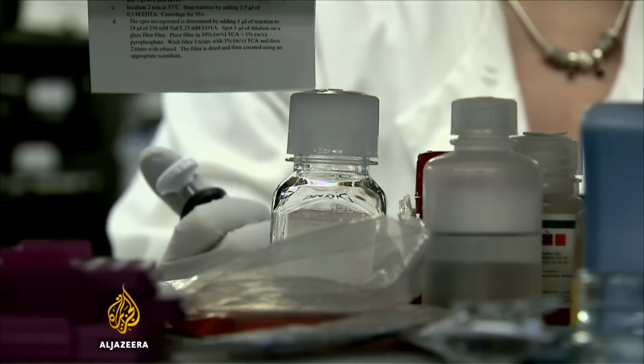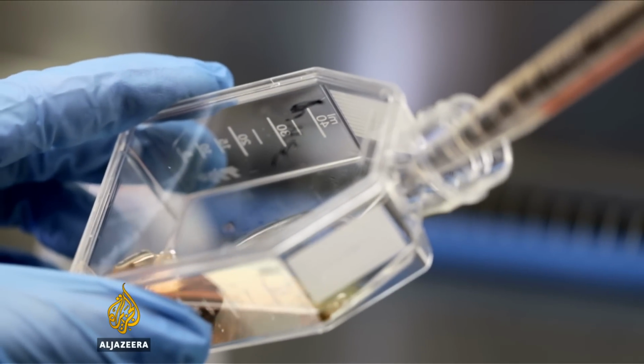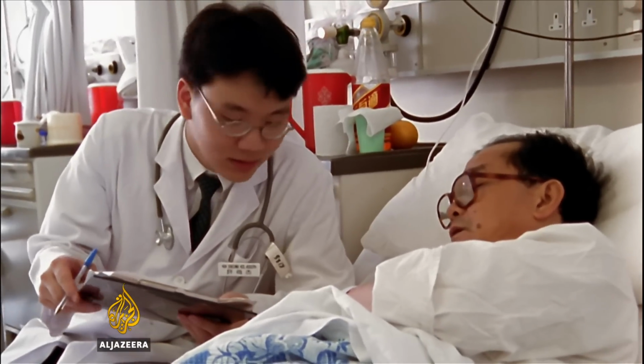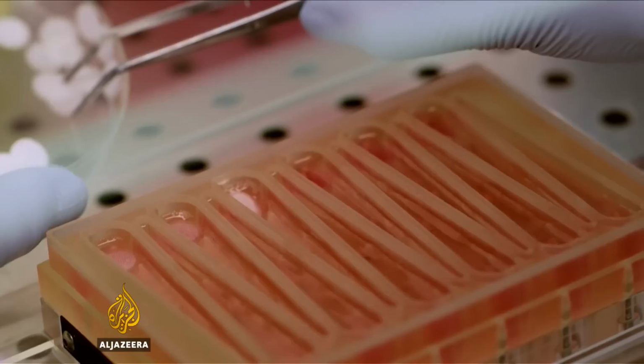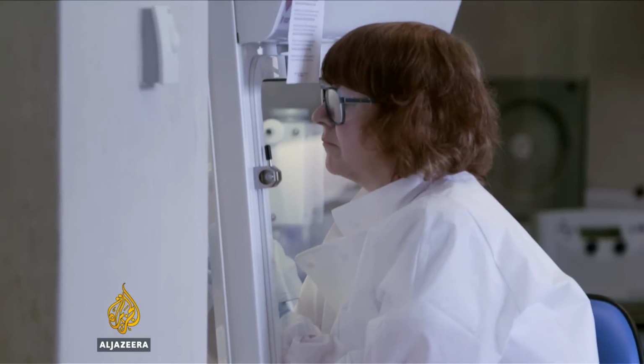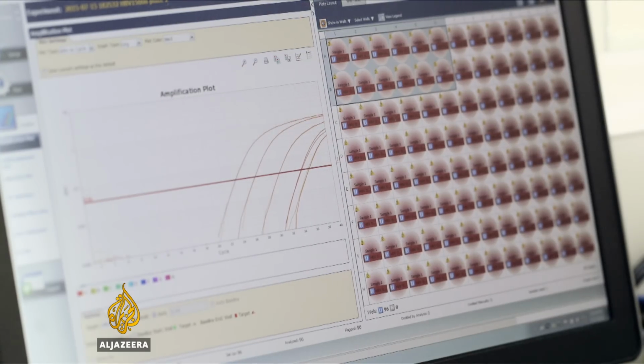The ability of scientists to develop new drugs is hampered by the fact that testing on animals has limitations when it comes to use in humans, whilst testing in humans has the potential for dangerous side effects. But new technologies being developed around the world are now replicating human organs on chips, allowing scientists to test drugs in a safe and controlled way.